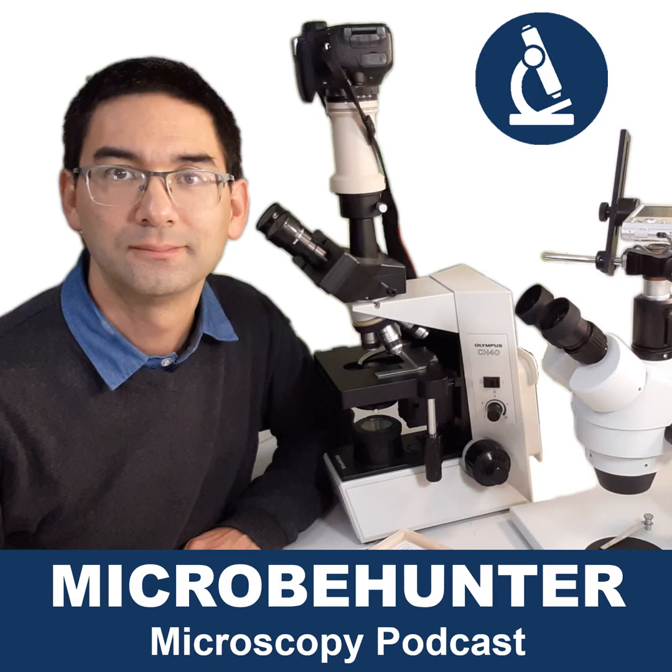Yeah, maybe to do a cell count to see how high the yeast density of your fermentation is. Maybe that could be done. But for that, you probably don't need phase contrast or differential interference contrast, DIC. Okay, so that is one of the things that we've seen in the last 50, 80, 100 years: we're moving away from doing science which is observation based towards science which uses other methods of analysis.